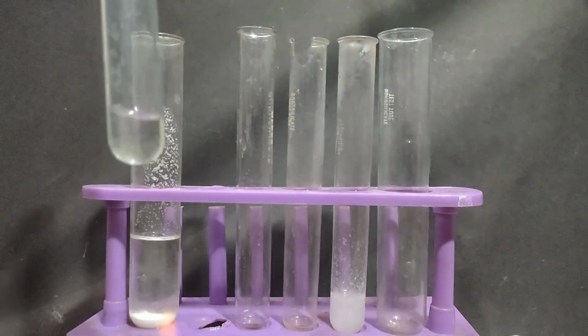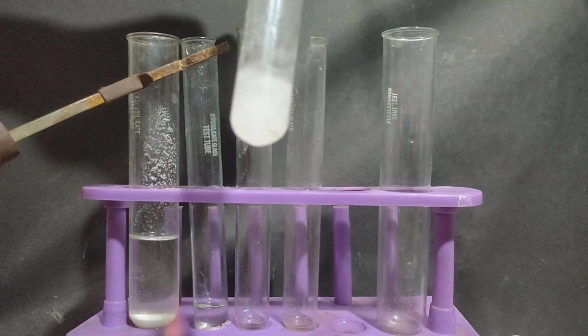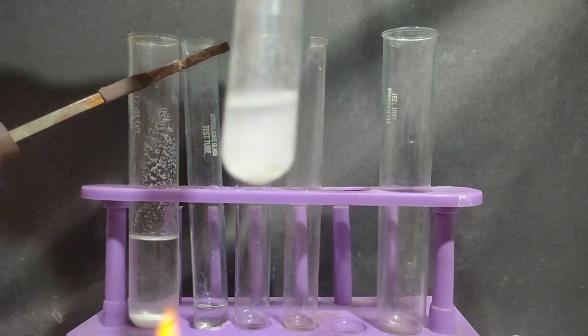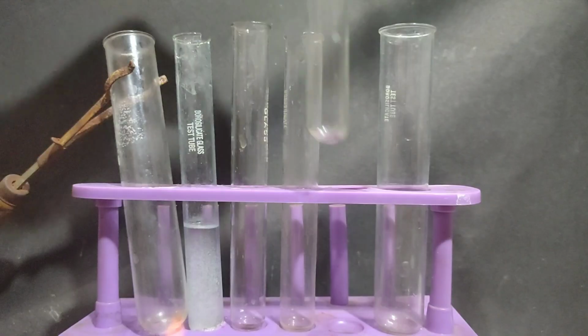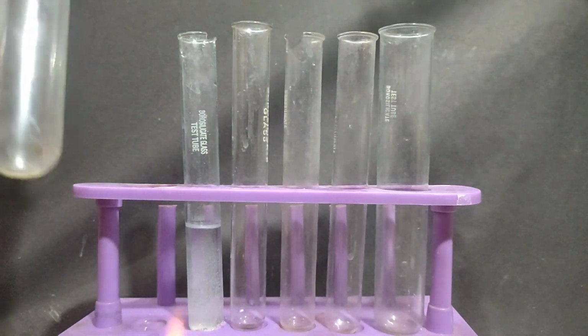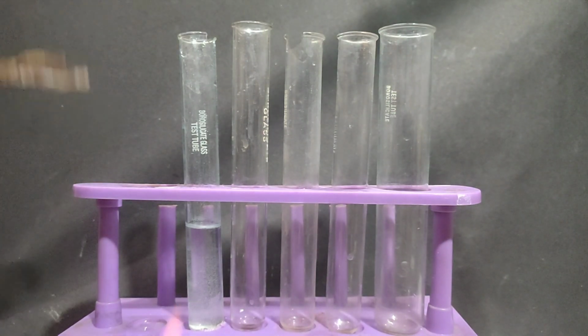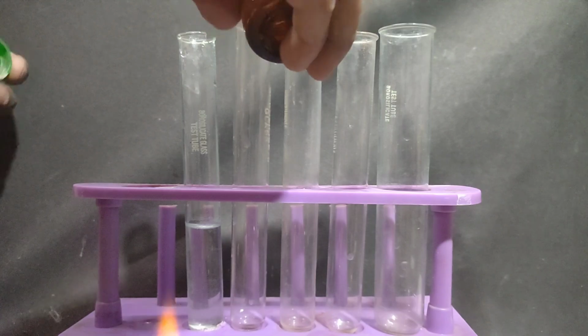Since I am working with a very small amount of solution, you can see that in one solution, when I poured it down, the solution cooled down, and on cooling again the white precipitate of lead chloride has appeared. Unfortunately my bigger boiling tube broke, so now I'll be showing you the test with this one. I have combined both the parts again, and before proceeding with dividing the parts, in the first test tube I'll be taking potassium iodide solution.